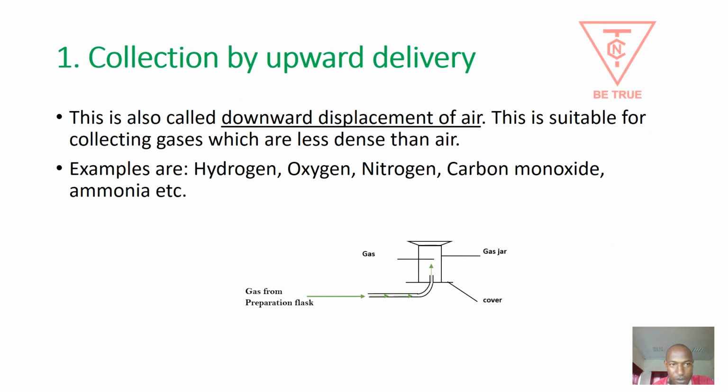The first method we are going to see is the method of collecting the gas by upward delivery. This method is called upward delivery because from the preparation flask, the gas comes through the delivery tube and it enters the gas jar upwards.